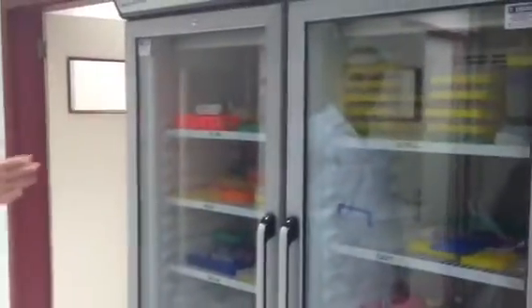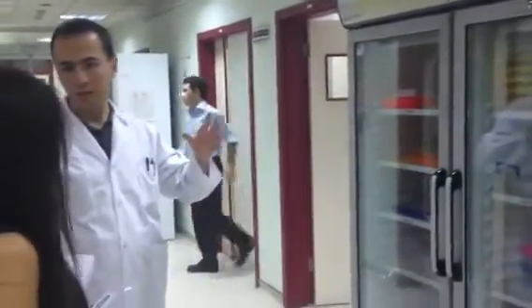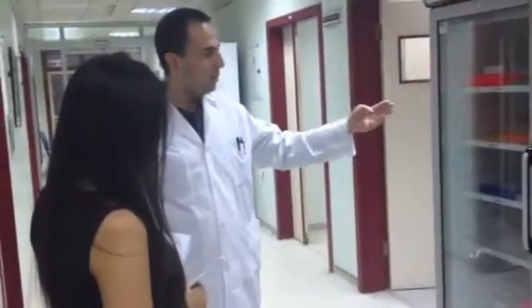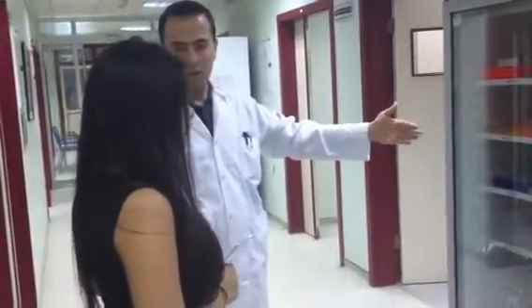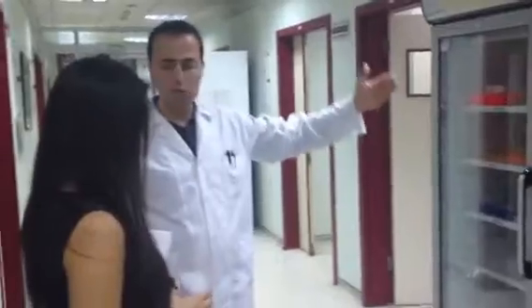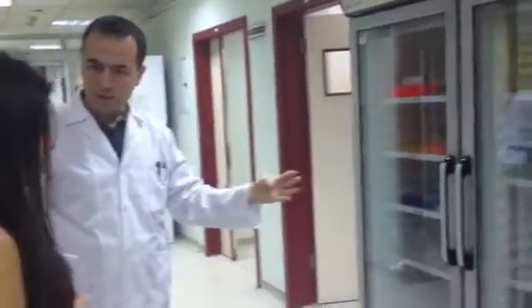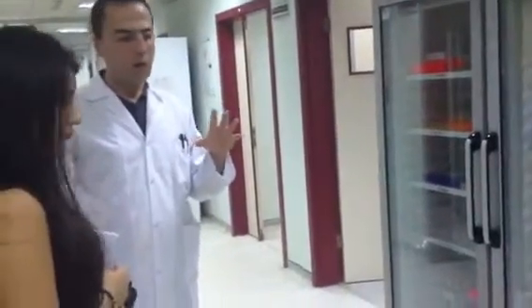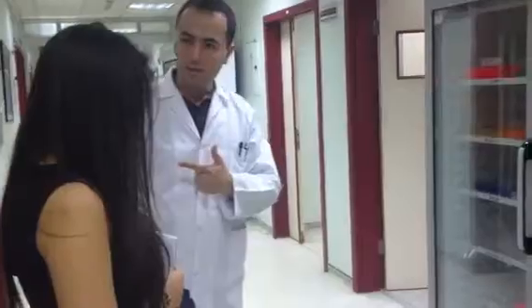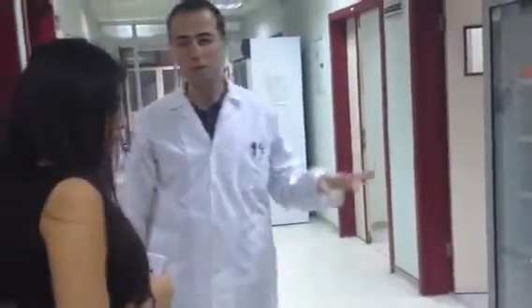We put samples in a cooler because of the DNAs, a lot of DNAs from different strains, working on a lot of projects, and a lot of DNAs are stored at 4 centigrade or negative 18 centigrade, or a lot of different temperatures in the laboratory. It's a cooler, different coolers in the laboratory.